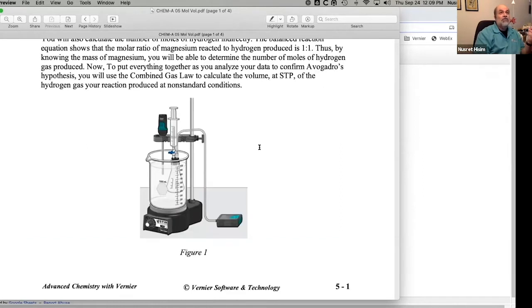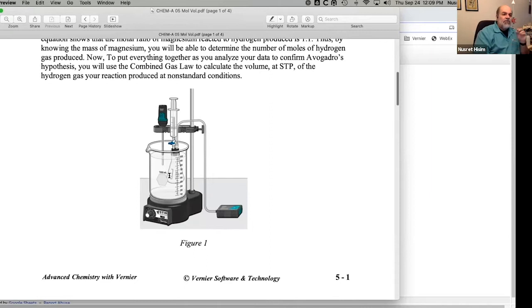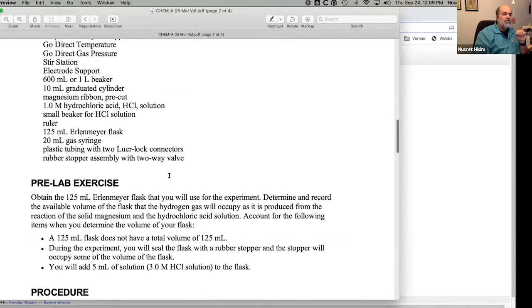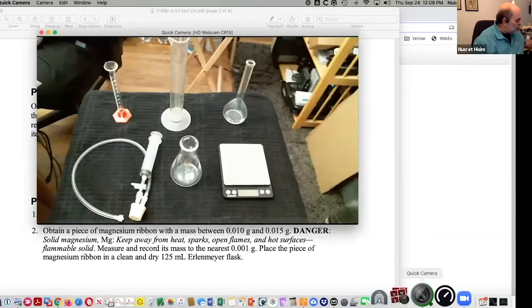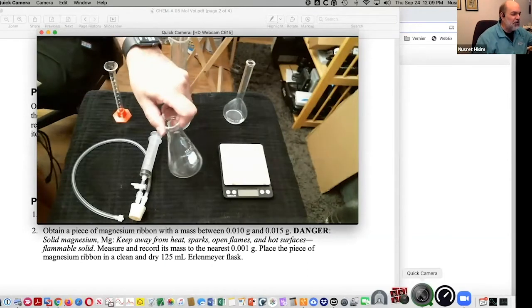Melissa made a wonderful video we're about to watch, and we're giving it to you too. What you're going to do is capture the gas in this flask and then measure the pressure and temperature of the gas. The first thing students need to do is figure out the volume of the flask. We're suggesting you use a 125 mL flask — here's one right here. I'm in my home laboratory, by the way. This is an Erlenmeyer flask similar to the one you'd use for this experiment.